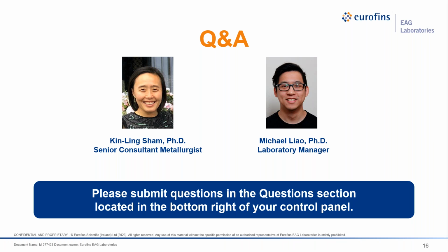Let's see, oh, the question moved. Are the fluctuations of the human body pH taken into consideration when testing? Can you repeat that again? I'm sorry, Michael. The question is, are fluctuations of human body pH taken into consideration during the testing? No. So it is not taken into consideration during the testing.